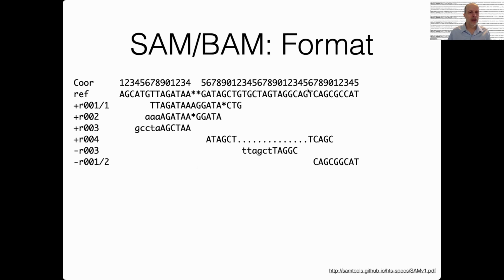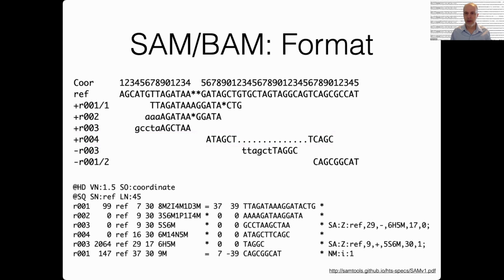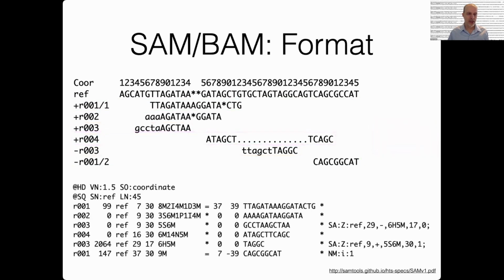I think I'm going to not go through this. I could talk for a couple of minutes about how you interpret a BAM file, but in the interest of time, I'm going to skip over that because I'm going a lot slower than I had planned. But I'll just show you a toy representation of a SAM or BAM file.